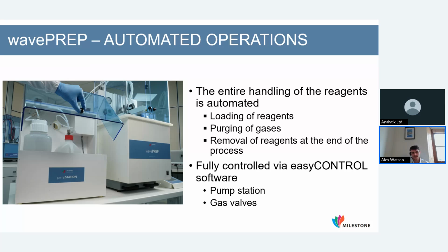An interesting point is the option to reuse reagent. We've seen that the concentration of the ammonium hydroxide isn't dropping considerably during a run. So if you're really pressed to reuse your C&D reagents, there's also the option of potentially reusing it.